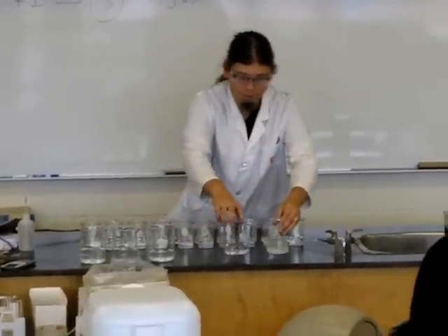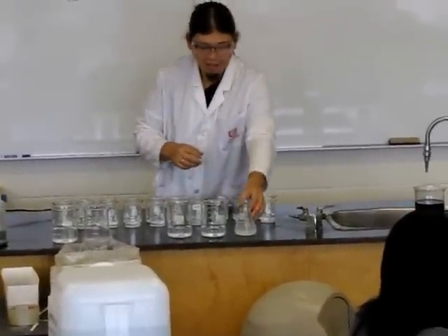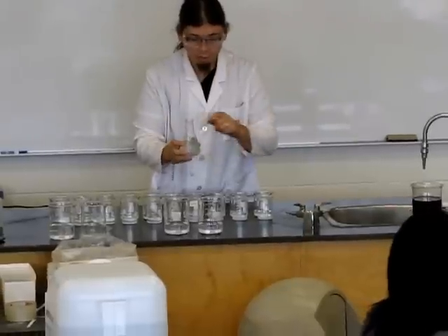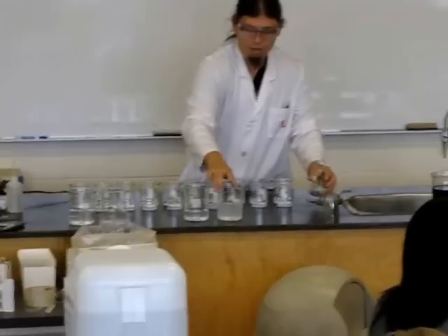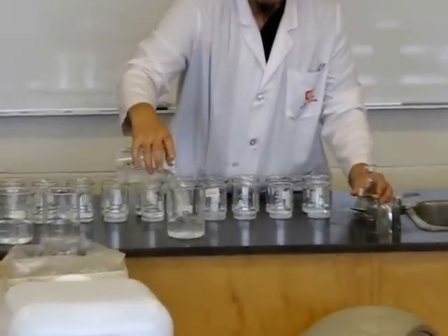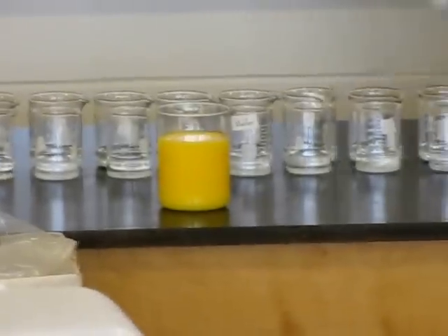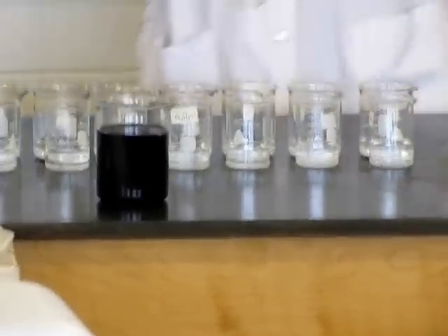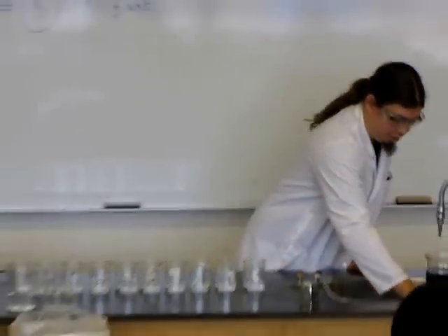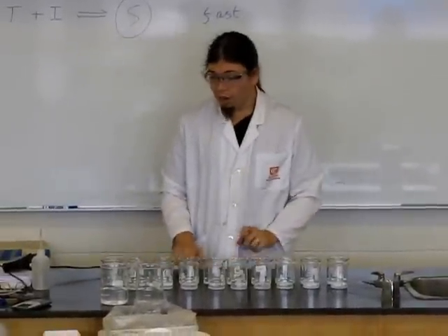This one is an old one, and sometimes referred to as a Halloween reaction, because it gives you some quite Halloween kind of colours. So I'm going to put this one in here, and then both of them in there. Kind of Halloween-y colours, right? It's also known as an old Nessel reaction as well. It involves some mercury, so I'm going to have to use both of that carefully — it won't go down the sink.